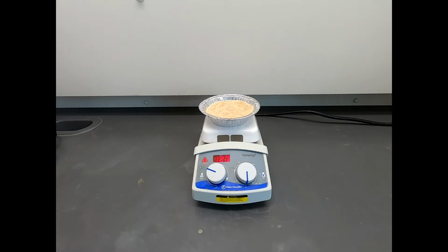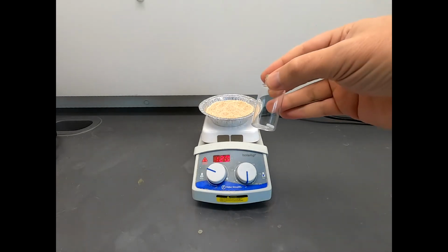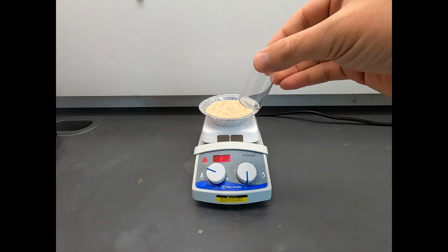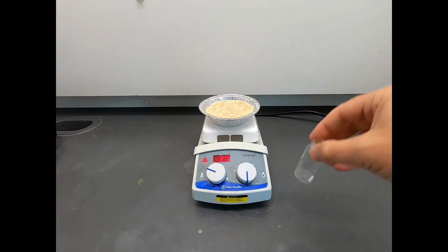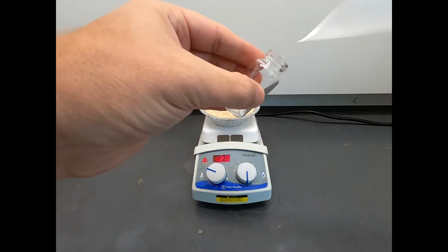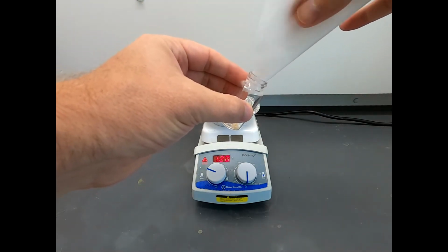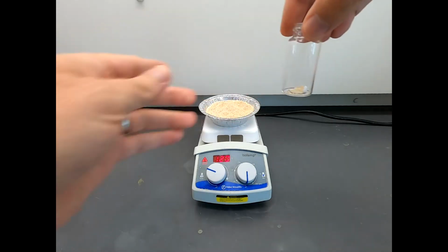Wonderful. Now we are in the hood and we're ready to begin actually setting up the reaction. So the key reaction flask is going to be this 20 milliliter scintillation vial, and it has a really small stir bar in it. And to that vial, we are going to add the hydrazide that has been weighed out. I have it off camera, so let's bring it in here. So that's 190 some milligrams of our hydrazide.